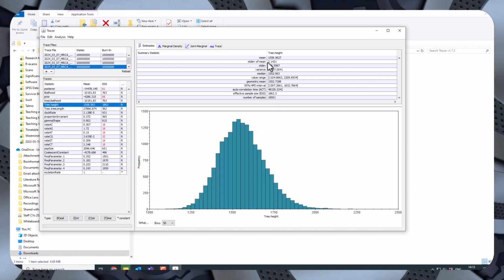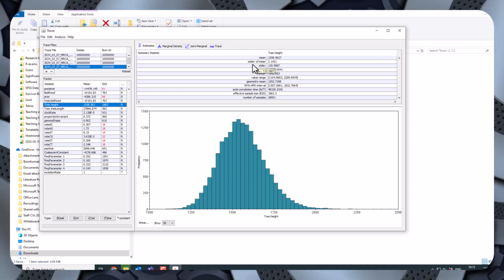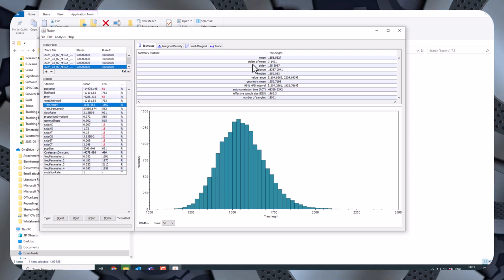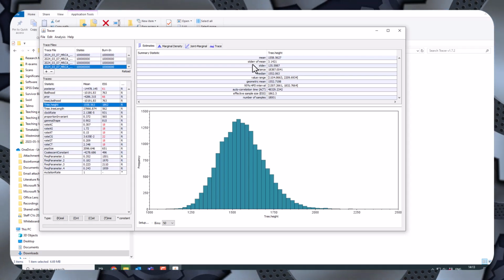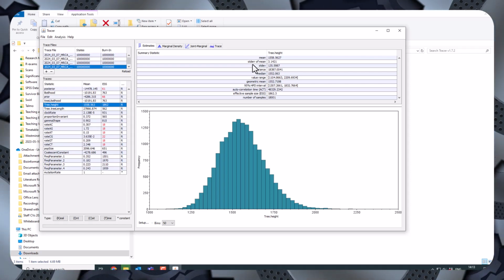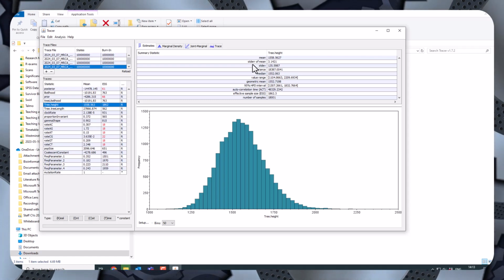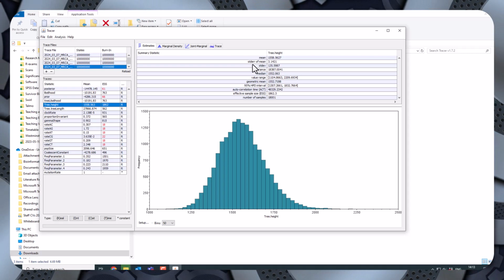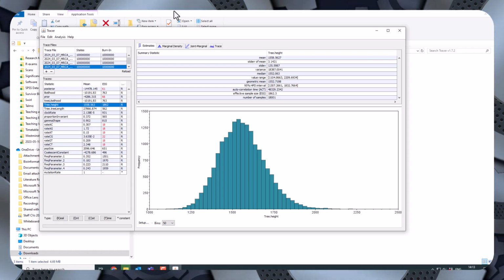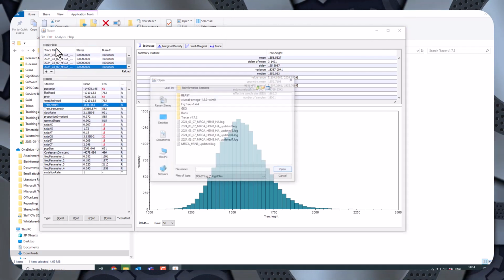Done. Now I'm going to import the last trace file, which was from the initial file I created without doing any thinking about things. If I open this one, what? Okay, they're also all bad. That's annoying. So this one is median 1535, but this one's got lots of lower values than I want, so I don't like that one.